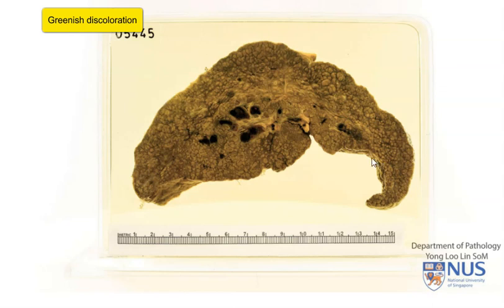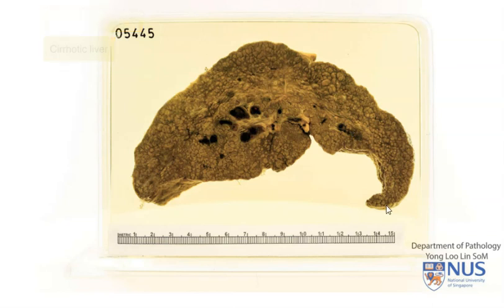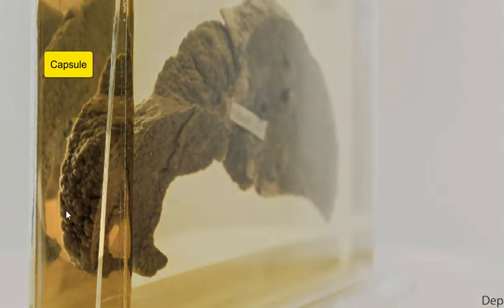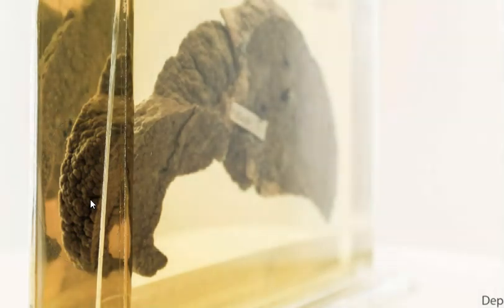What we have here is a cirrhotic liver with a greenish discolouration. Most likely, this liver would also be smaller. If we look at the capsular surface, as we can see here, we can actually make out the nodularity very clearly indeed. Because the cirrhotic nodules are so small, this is micronodular cirrhosis.